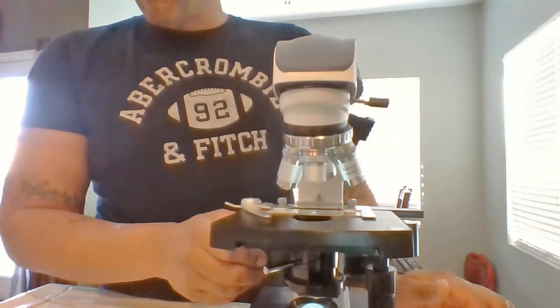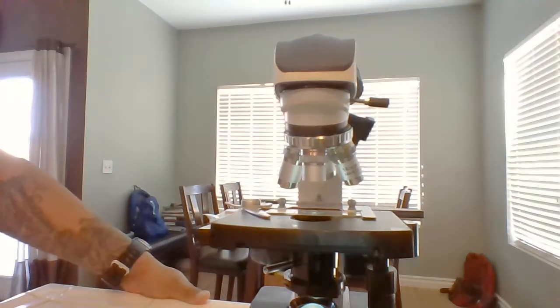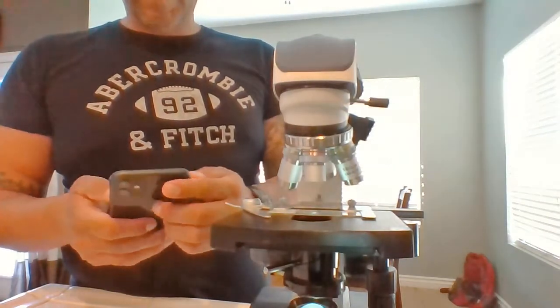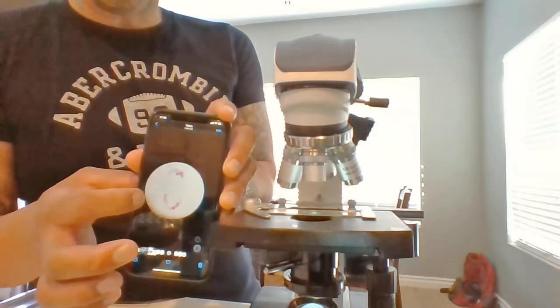From here I can adjust the power, choosing different objectives, like I said, by sharpening those edges. And for video purposes, I've already taken pictures of the slides, with 3 different views.